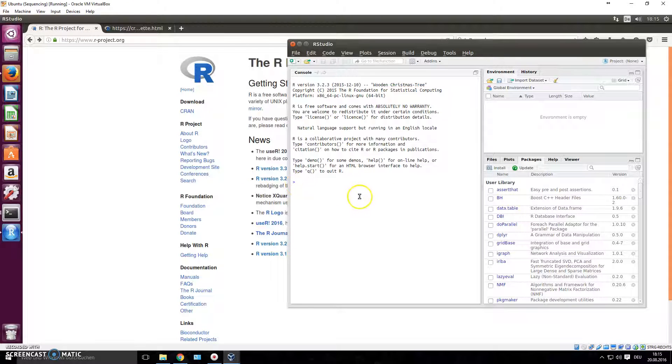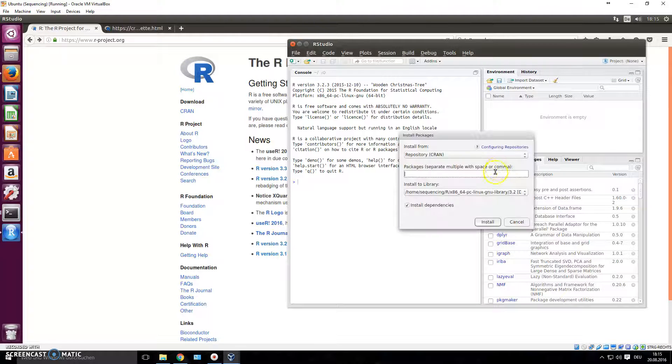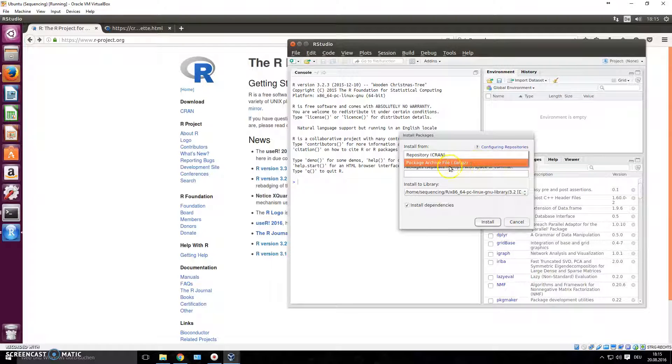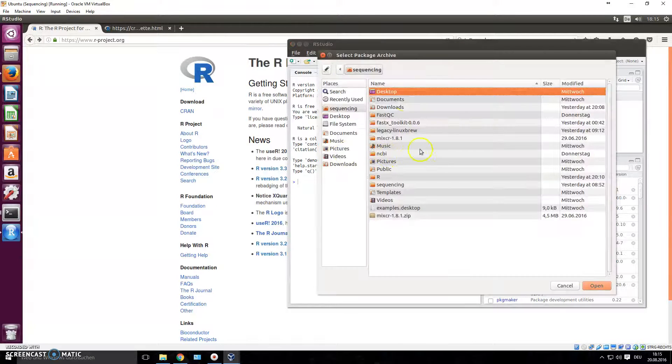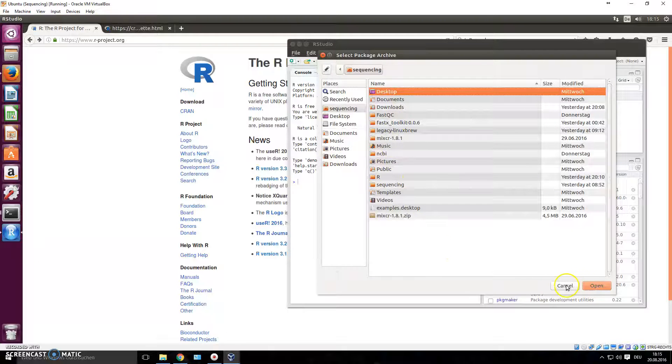If that still doesn't work, you can find the package online, just Google it and download the file in .tar.gz format, and then you just click this and you choose the file from here.